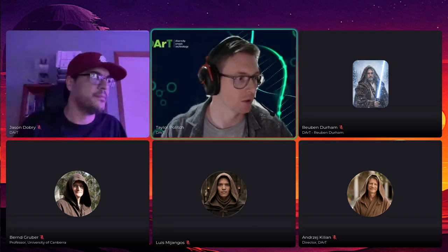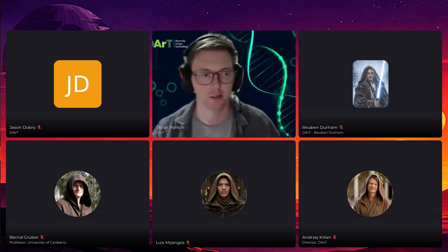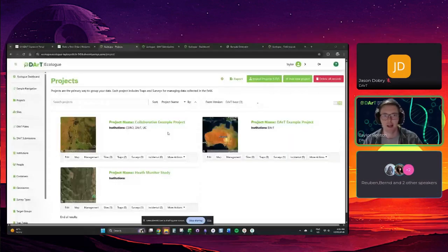Thanks, Jason. Just share my screen again. Get a bit quicker at that.